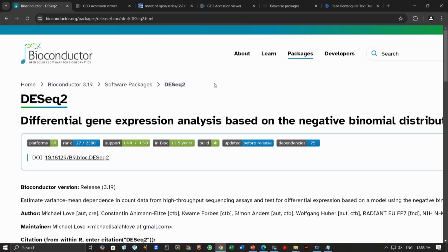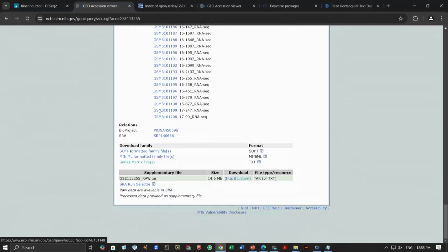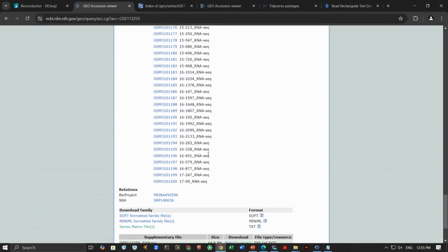We have, for example, the counts per million data. This data set you can also access as counts per million data. So, here you can see this raw data, and if you download, this is the counts per million data. We do not want counts per million data. You can also do the transcripts per million, so TPM normalization. You can do different types of normalization, but there are drawbacks for different types of normalization which we discussed in the earlier course. One of the preferred methods is either median of ratios or the TMM normalization. So, here we are using the median of ratios method.